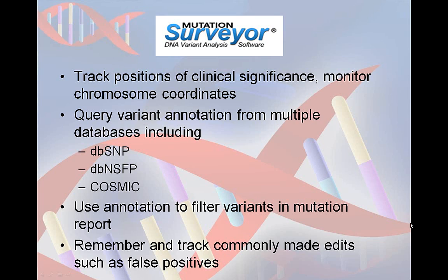In addition to the external database functionality, Mutation Surveyor 5.0 also allows users to construct a custom database of commonly made mutation edits such as deletions of false positives or sequencing artifacts. These entries can be saved and queried for future projects, allowing users to easily track common edits made within a mutation project.